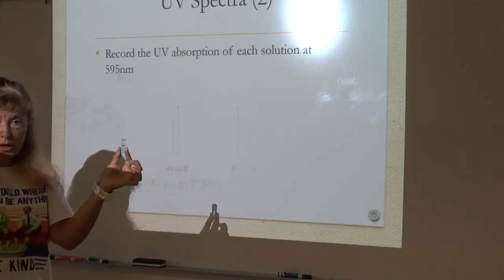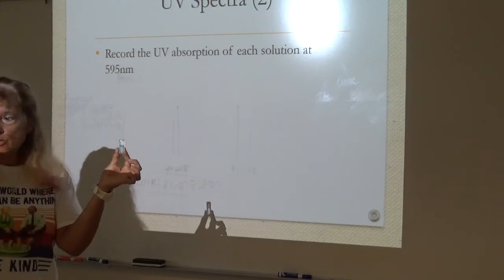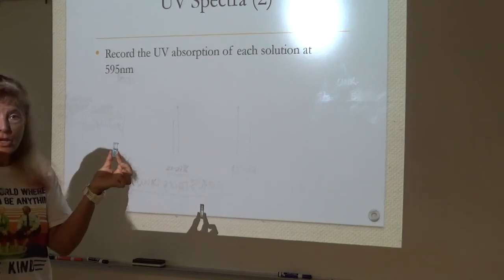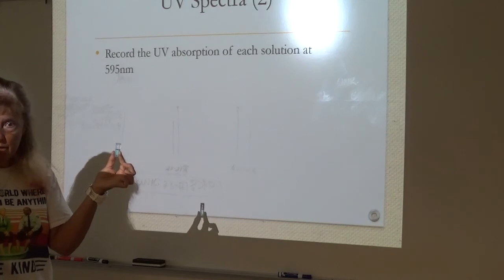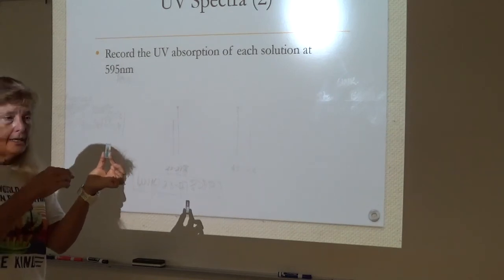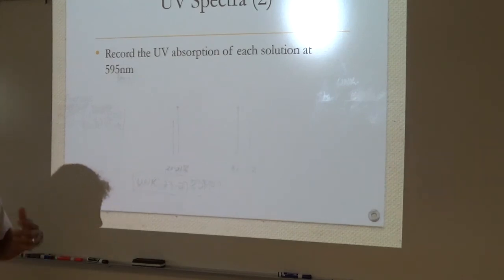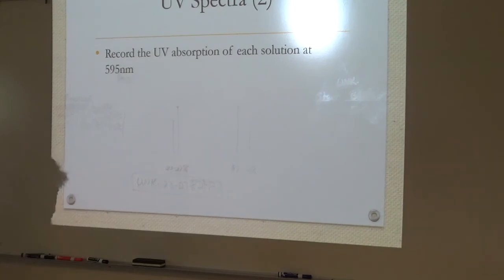You're going to use 1 cuvette for the entire experiment. The instructions on the spectrophotometers say to start with the highest concentration, so the 5 ml standard. Put the cuvette in appropriately, read the absorption, record it, and then move on to the next one.